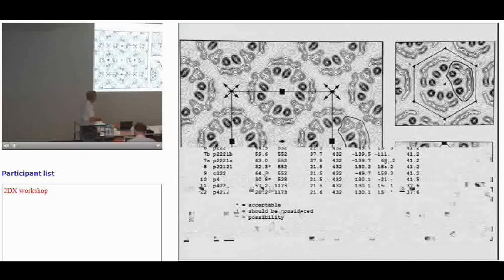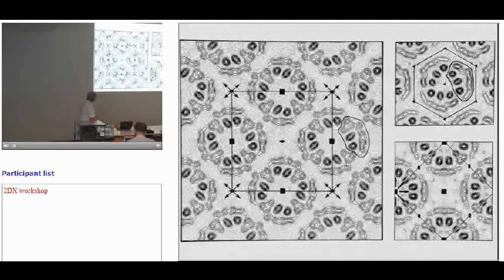And we thought it was 2 layers with a small unit cell and some perturbation. Actually, this is the real unit cell. And the molecule is there, and the 4-fold arrangement of the 4 molecules is very similar to the upside-down 4-fold, and that's what causes the spots. So this is the proper space group, P4212, and this one, which was 422 with a smaller cell dimension, is wrong.